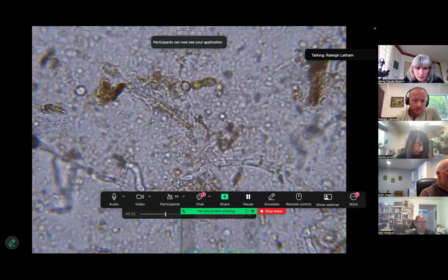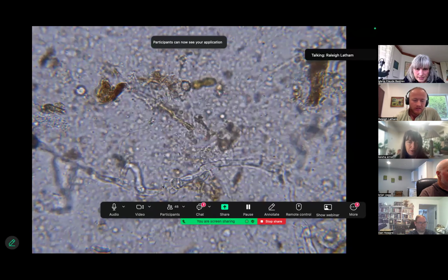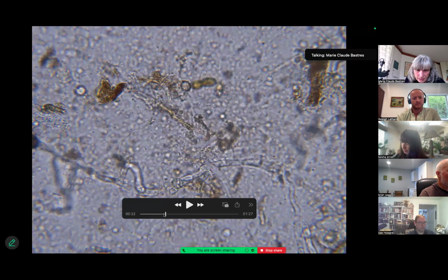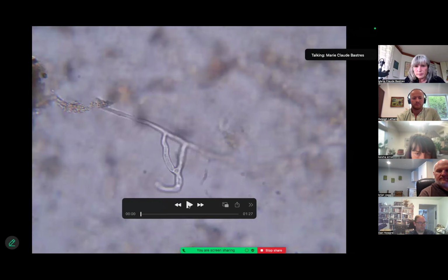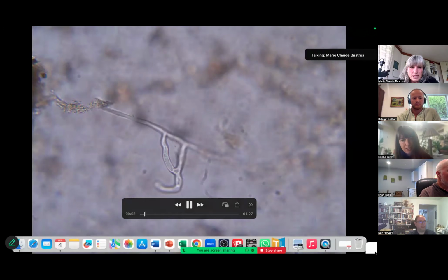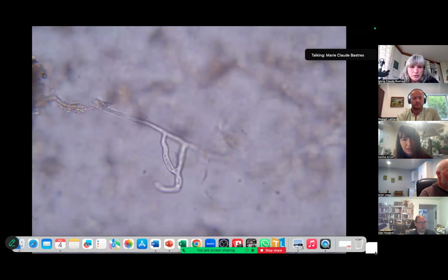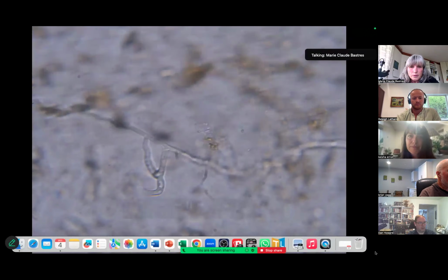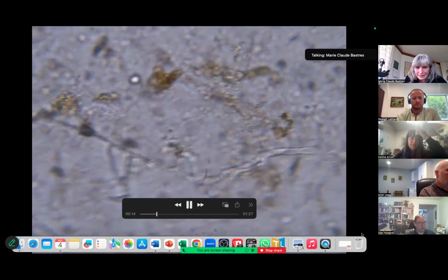So what is this we're seeing? It's not the same one, it's another one, but it's the same kind. Okay, see the rings, how they form? I didn't know if it was an Oomycetes or a fungi. I have no idea, but I was lucky. I didn't encounter them when I was doing this map, so I didn't have to decide.